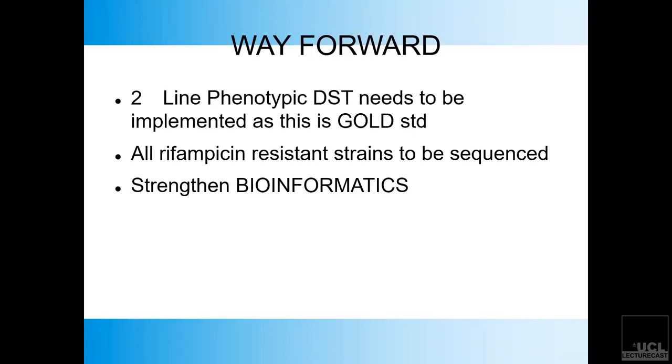I was just going to add on to what King was saying. What you are learning during this time, don't just think of it as something that can be used only for TB. These are universal techniques that you can apply. With the kit that we're using during the training, we've used it previously on gram-negative bacteria to sequence. So it's literally the same procedure. It's only the extraction that's different.